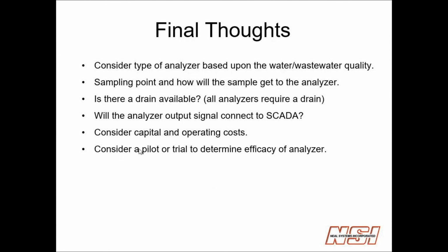Anything that changes the conductivity of the wastewater can cause a slightly different reading on the analyzer and cause erratic operation. So I recommend doing a trial. Ask your supplier for assistance. Obviously, we can help you with that.